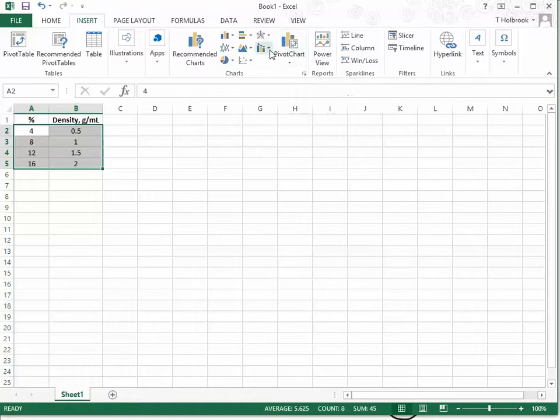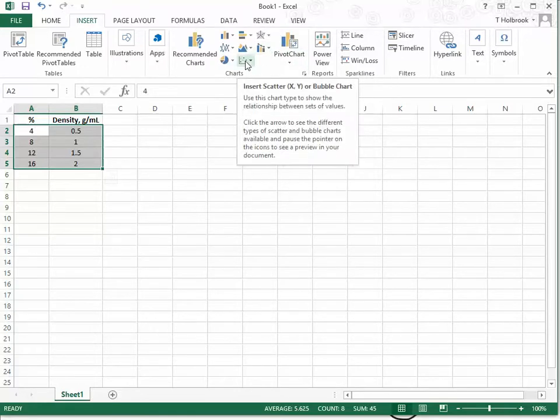The chart that we want is always what we call a scatter plot. It is a chart that will list the data points with no line drawn through them. We just want to put the data points in, and that is it. We don't want Excel or the graph to connect anything at all.